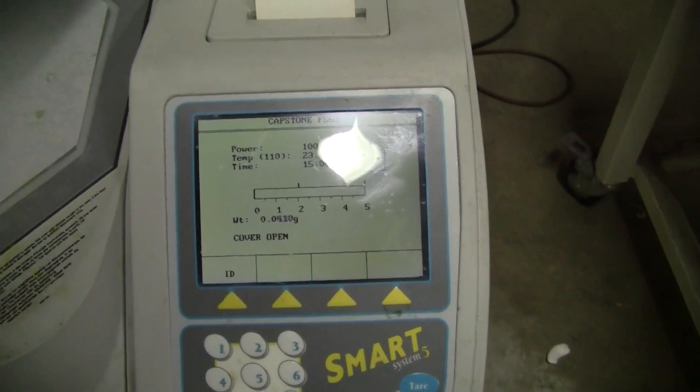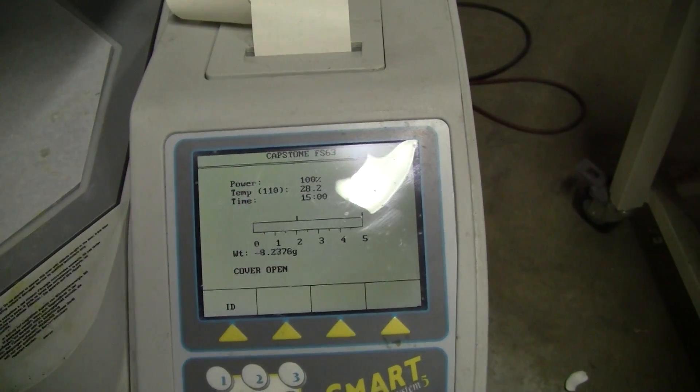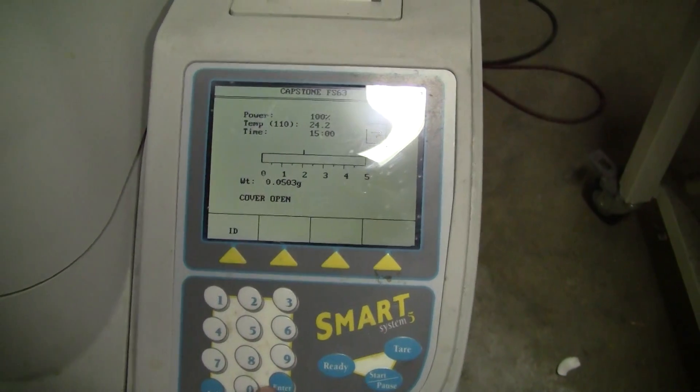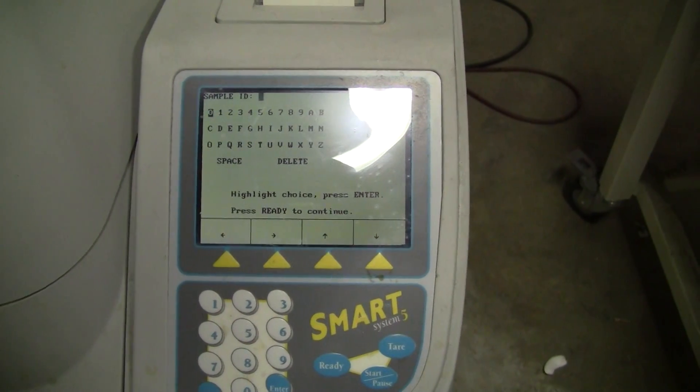Let's see the weight change. I'm going to take the sample off. The scale is working properly. All right, everything seems to be working.